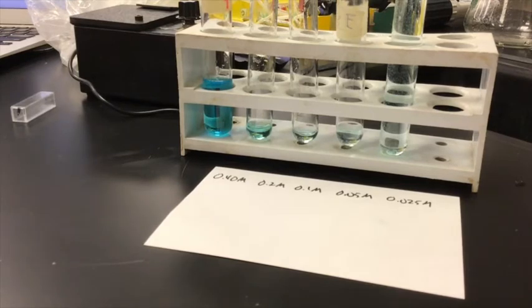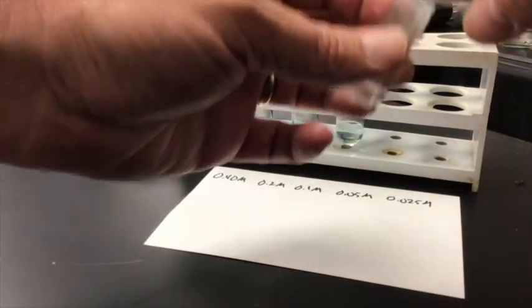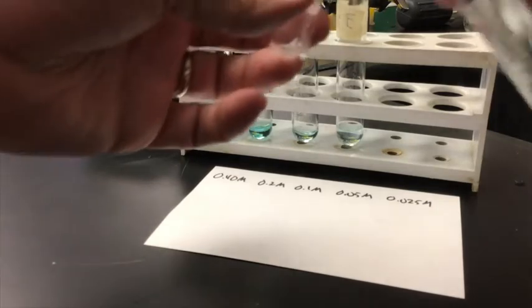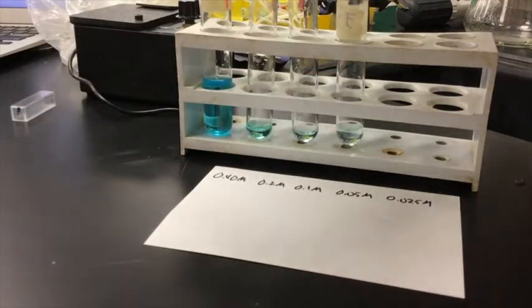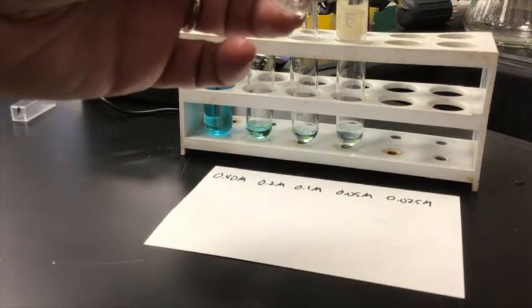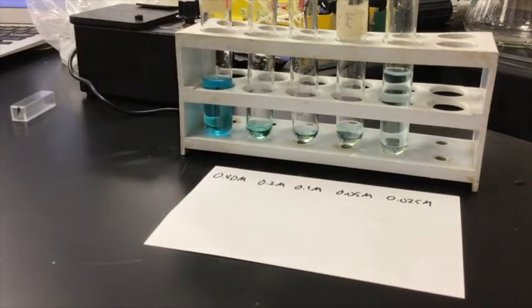One more to go. Stay on target. Dump that. Here's my 0.025. So there's my 0.025. Here's some 0.025. And one more time like so. So that's the 0.025, should be my last one.